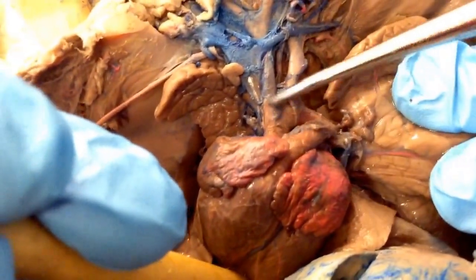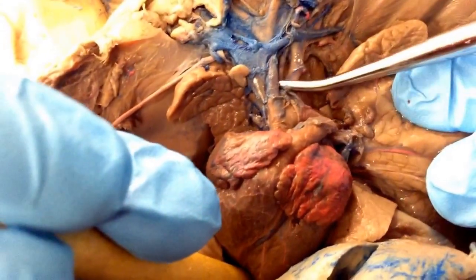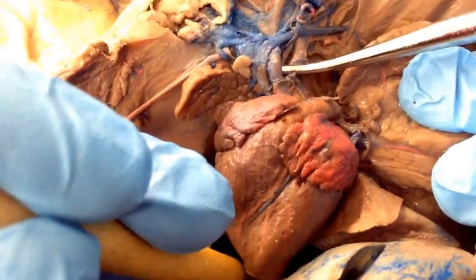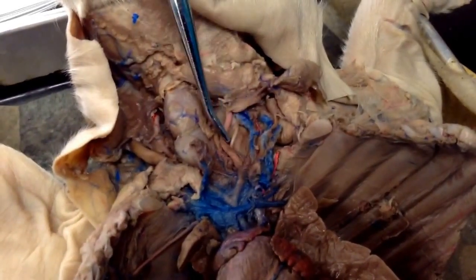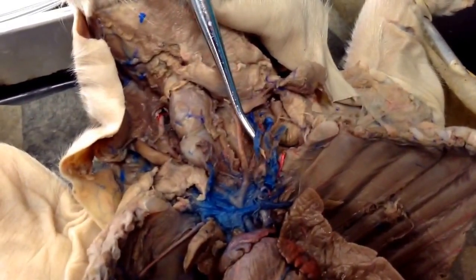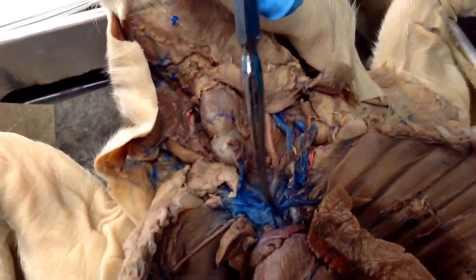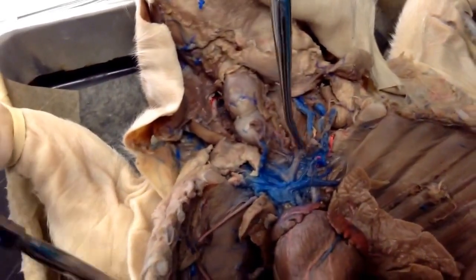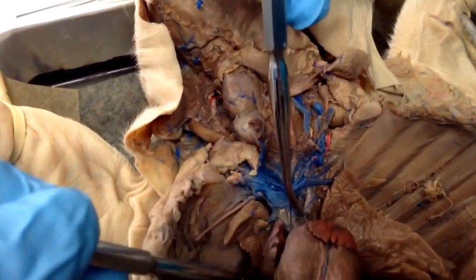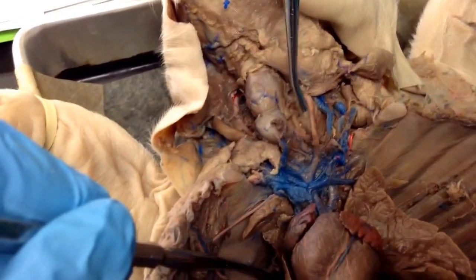That's the aortic arch. That right there is the left subclavian artery, and that is the brachiocephalic trunk. The carotid arteries, there's one on the other side too. That's the internal jugular vein and the external jugular vein. And the 4 jugular veins come together to form the superior vena cava, which then goes down under that away. And the 2 carotid arteries come together to form the brachiocephalic trunk.